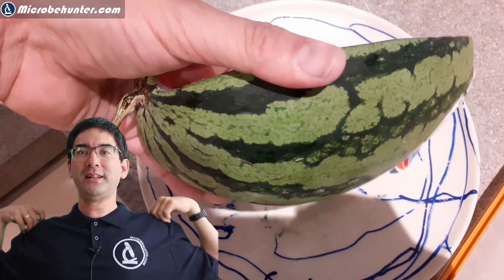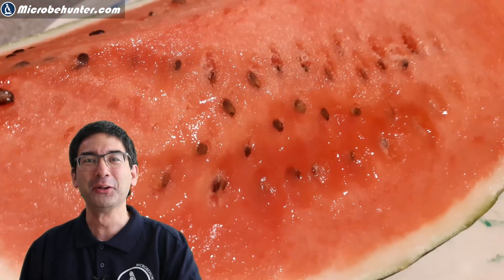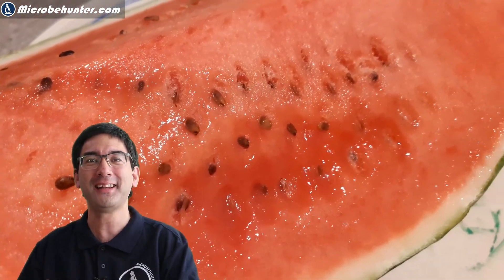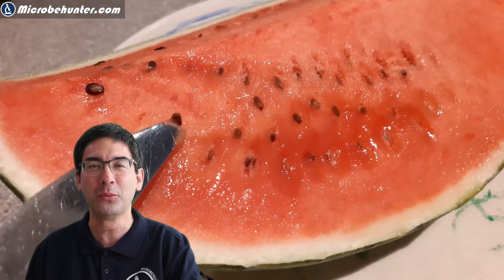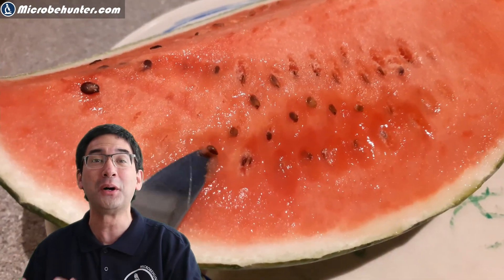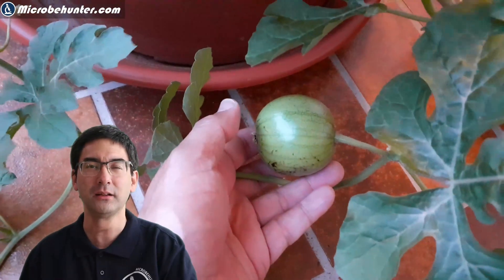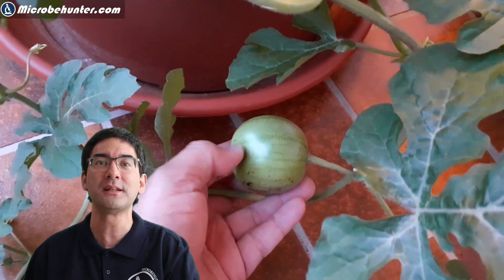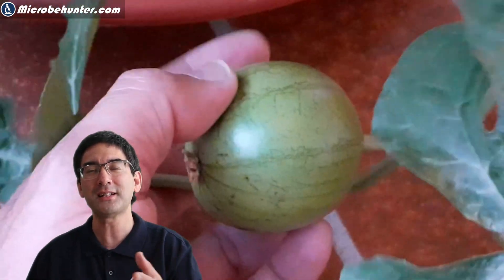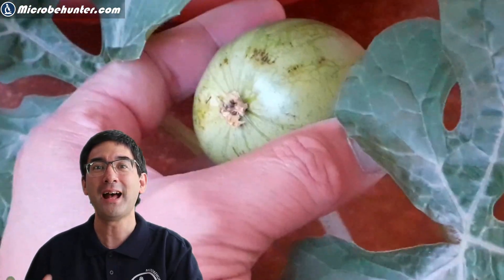Hi, hello and welcome — Microbe Hunter here. As the title of the video says, I'm going to put this watermelon under the microscope — not only this one, but also one that my kids have grown on the balcony. It's still a little bit difficult to do, and I'm going to show you how later.